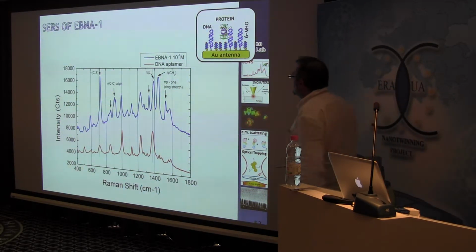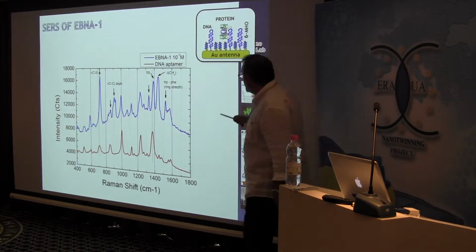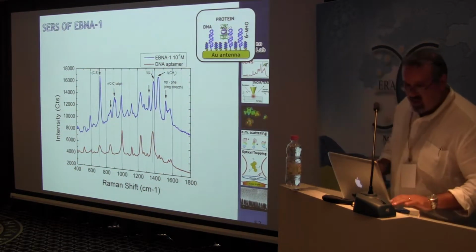The bottom one is DNA. This is the signal. No, sorry, I'm very sorry. So this is the upper. This is the protein. We can go down to 10 to the minus 7.